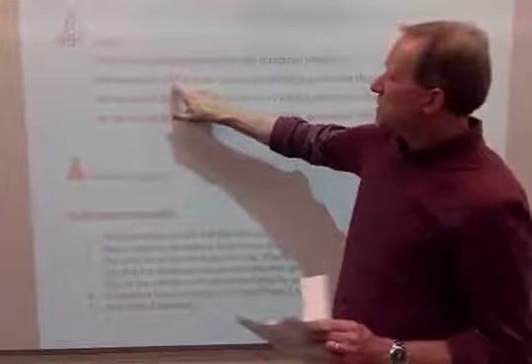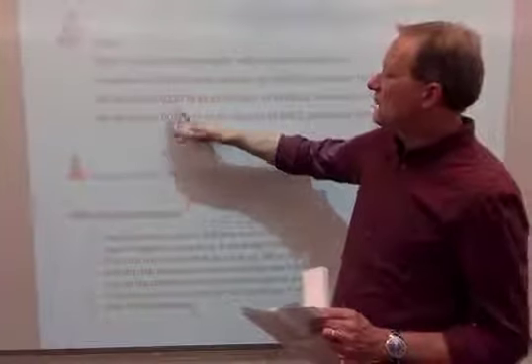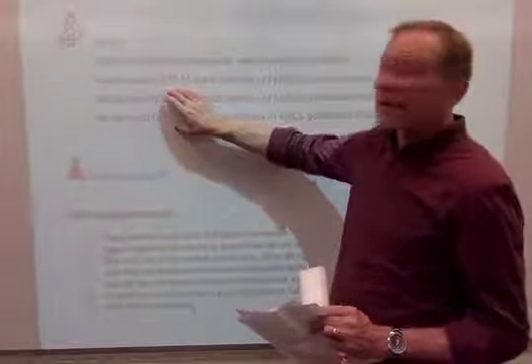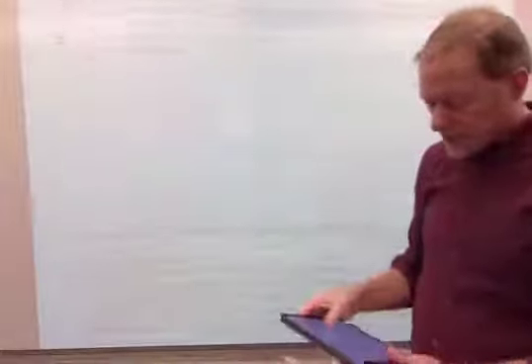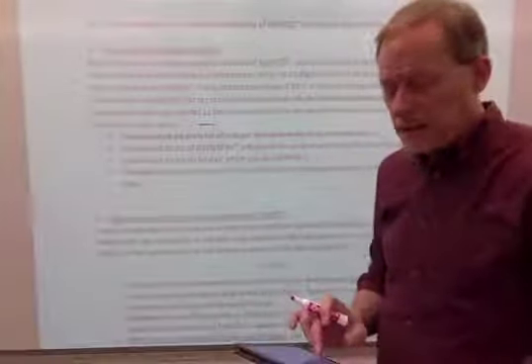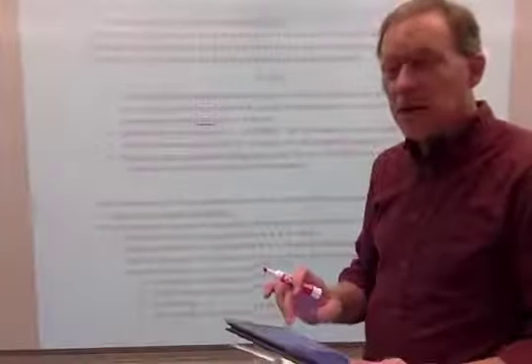So you can easily see if we make mixtures of its most concentrated solution with the thiocyanate, that it is going to have an excess of the iron 3 plus. The later solutions will be made up of combinations of the last two of these. Now, if you'll go with me to the second page. Part A is preparing. Okay, here we are on the second page of our lab guide, and I'm going to go to part B, which talks about Beer's law.